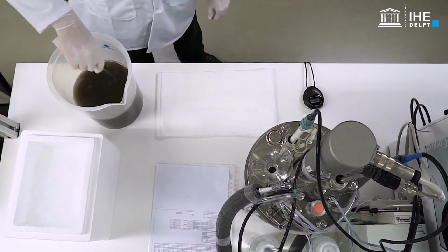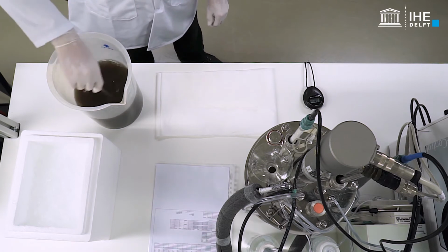Repeat, if necessary, until pouring the required volume of sludge into the reactor.